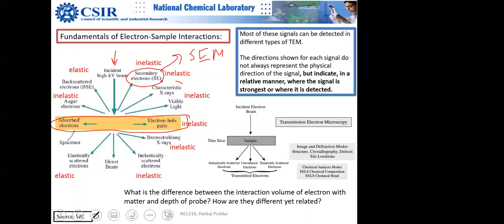So then you can have X-ray emission, which is very useful, and gives you analytical chemistry information. ये कौन सा atom उसमें है? Moseley का याद है ना? I discussed Moseley. Then you can form an electron-hole pair here, because some energy is transferred. So from the valence band to the conduction band, electrons are kicked out. Those electrons in higher energy states can bounce back to the ground state, and then you can have visible light also. You have bremsstrahlung X-rays also, which is one of the signals I don't find much use for. It's the only signal.